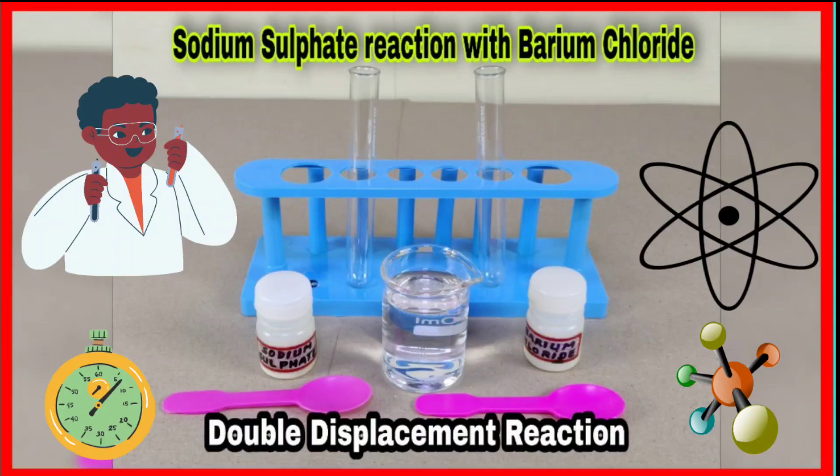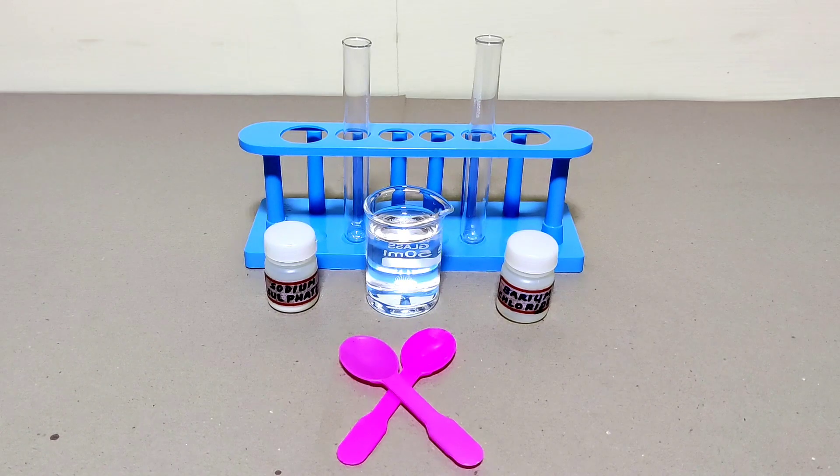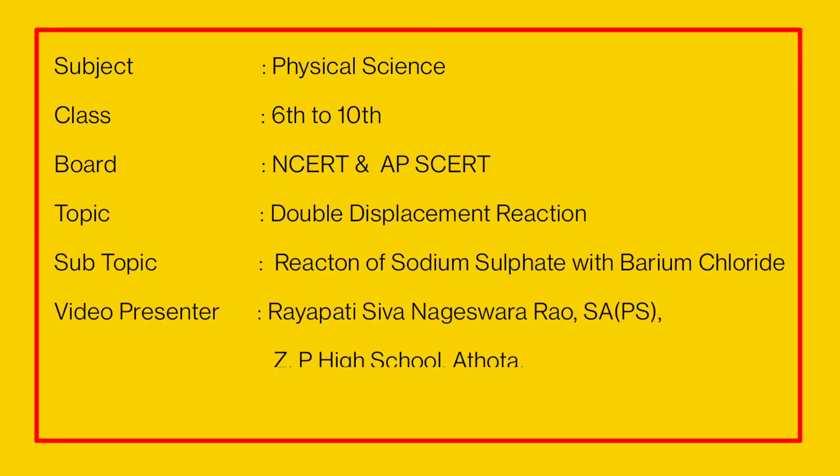Hello students, how are you? Today in this video I will demonstrate the reaction of sodium sulfate with barium chloride. This is a double displacement reaction.